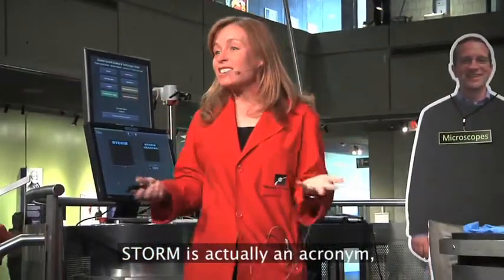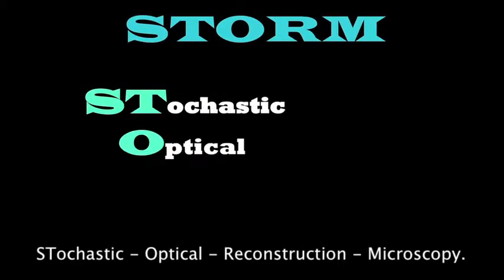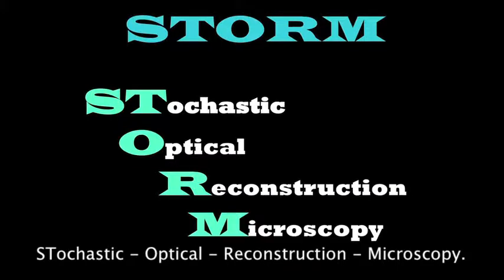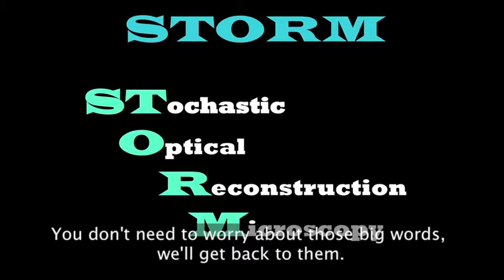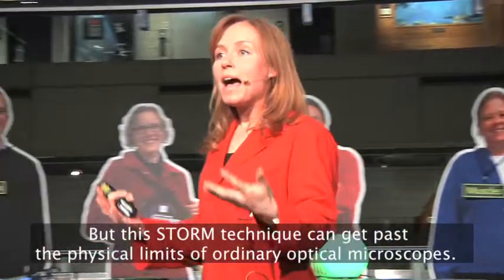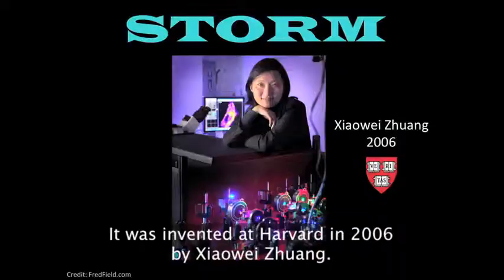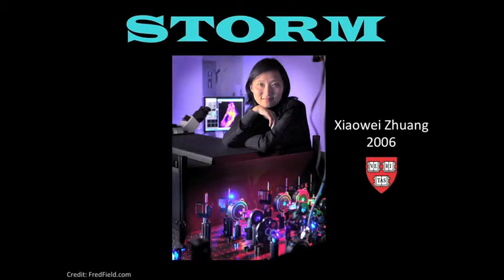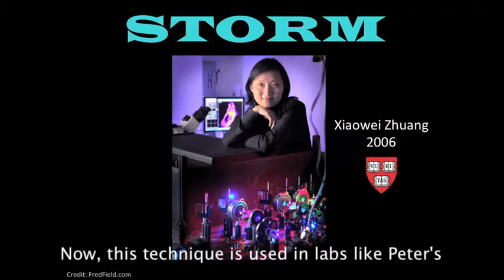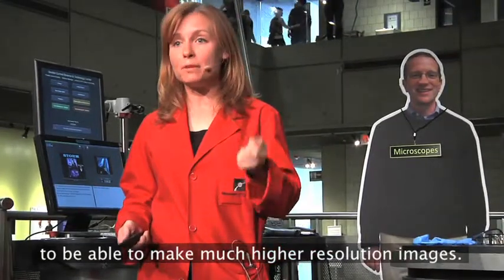which, if I'm honest, actually has nothing to do with weather. SToRM is actually an acronym. SToRM is an acronym for an imaging technique that stands for Stochastic Optical Reconstruction Microscopy. You don't need to worry about those big words, we'll get back to them. But this SToRM technique can get past the physical limits of ordinary optical microscopes. It was invented at Harvard in 2006 by Xiaowei Zhuang. And now this technique is used in labs like Peter's to be able to make much higher resolution images.